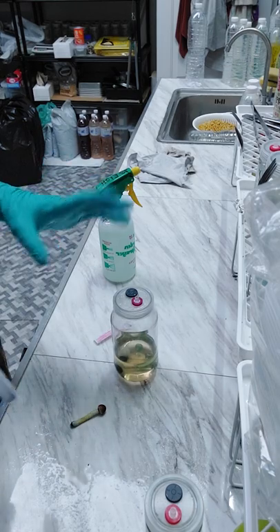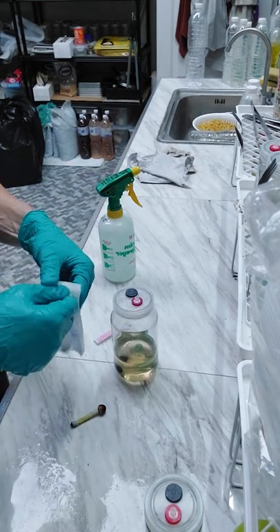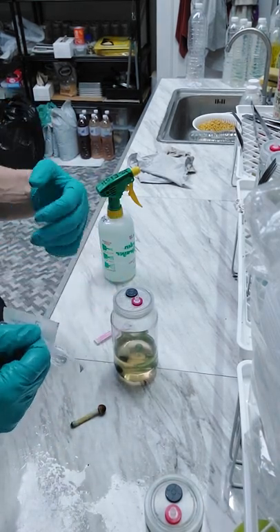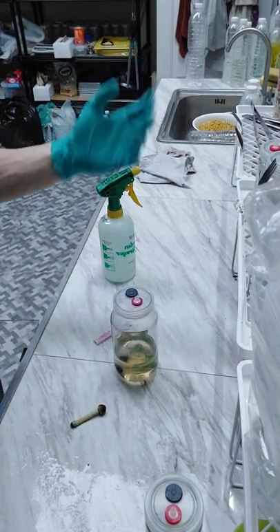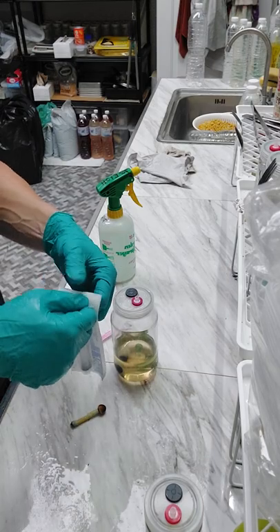So after that it'll be pretty self-explanatory. I'm going to stop talking and I'm going to hold my breath. Not using any filtration — I'm working in my kitchen — and yeah, just try to work as quickly as you can.